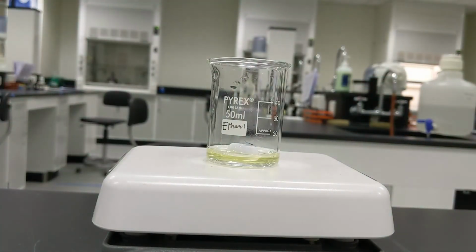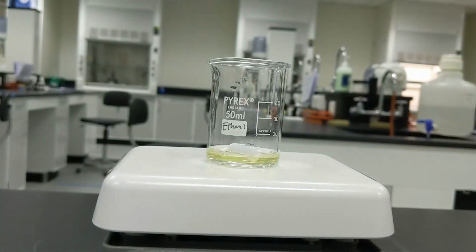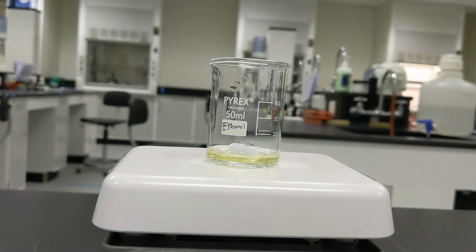Now, what I have is an egg white, just a little bit in a beaker. You can see it at the bottom. We're looking at maybe 5 milliliters or so. And in another experiment on the side, I'm going to take some of this cream that I got from Tim Hortons and put it in a jar like this, and I'm going to shake it up. I'll do that off camera because it's going to look really silly.